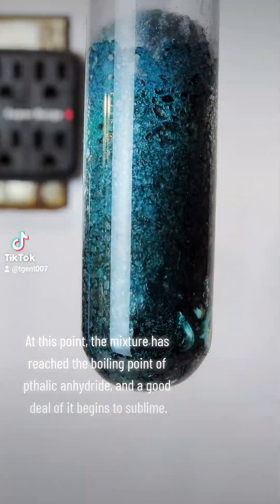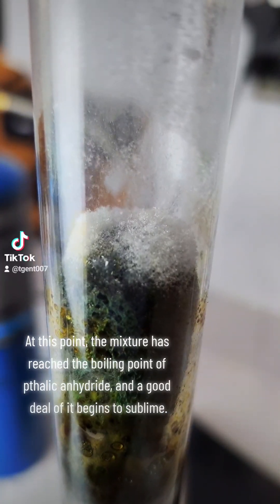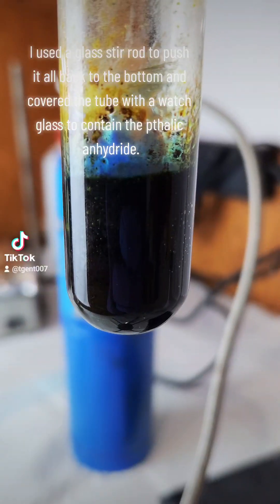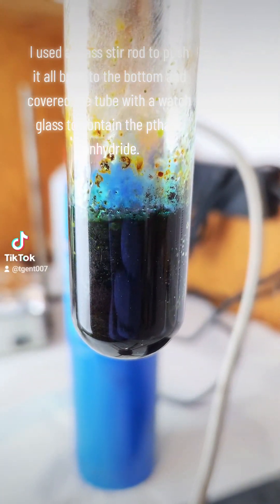At this point the mixture has reached the boiling point of phthalic anhydride, and a good deal of it begins to sublime. I used a glass stir rod to push it all back to the bottom and covered the tube with a watch glass to contain the phthalic anhydride.